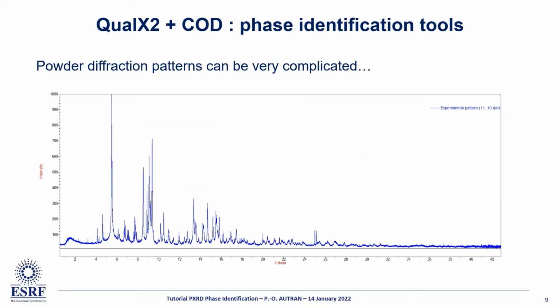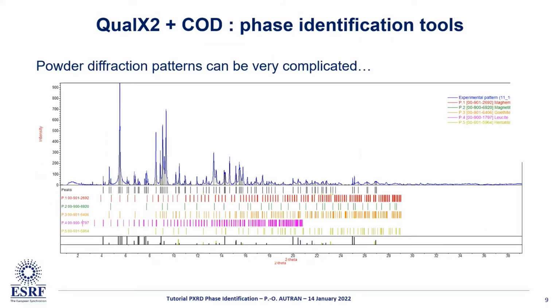In practice, it can be very complicated. This is an example of one sample I had, from a powder found in a Pompeii vessel. It contains lots and lots of things, with variable sizes in the crystal powder. But out of that, we are able to identify phases. Here I managed to identify most of the phases present, not all of them. This is very complex, but you already have like 5. This is the result we hope to have doing this analysis. Here you have a few iron oxides, and so that's it.